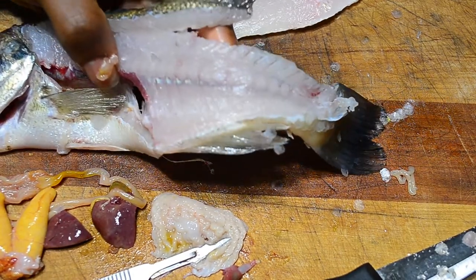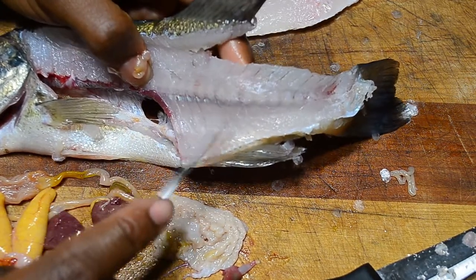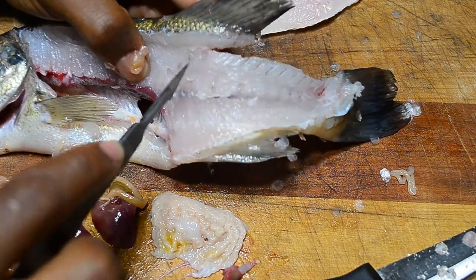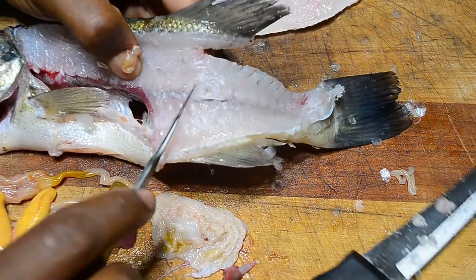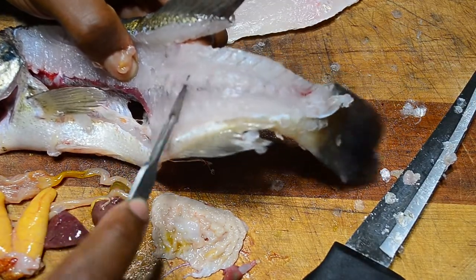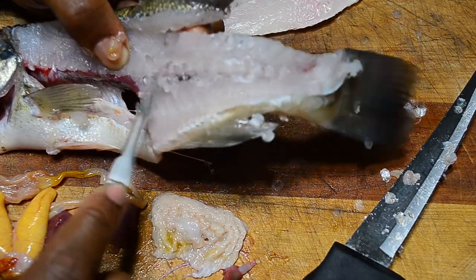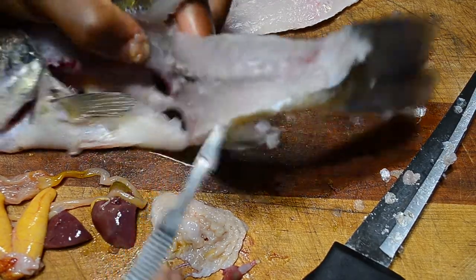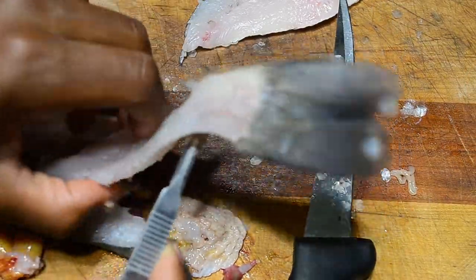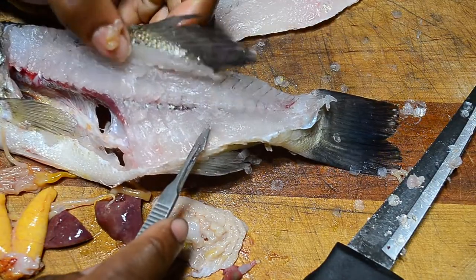You can see the spine clearly here, along with the other veins that feed the fins and the other organs.